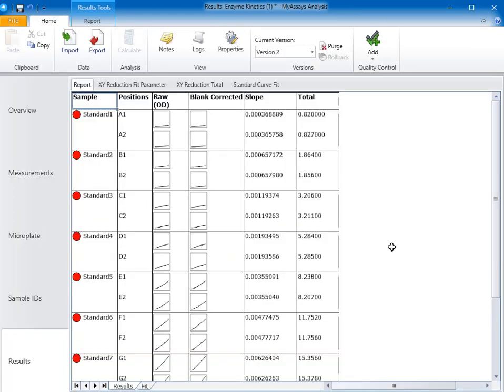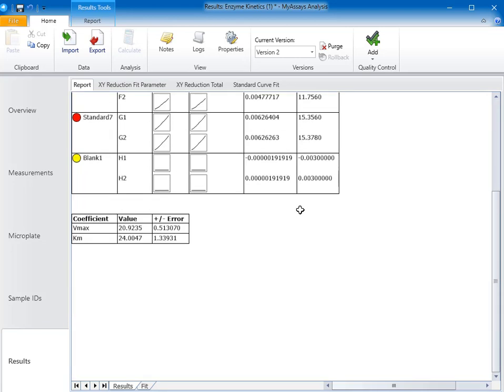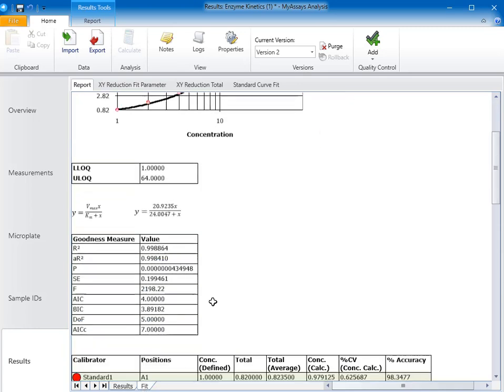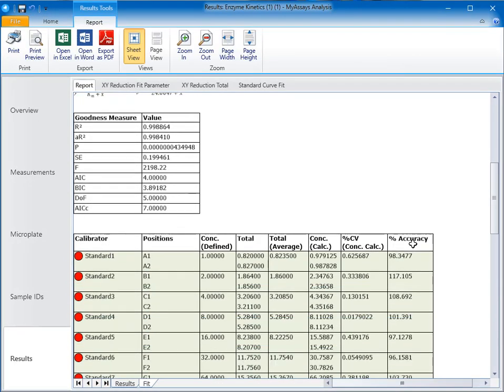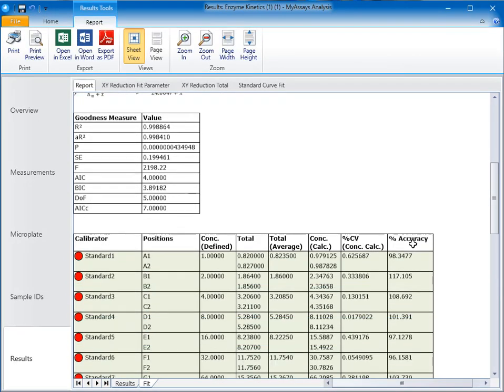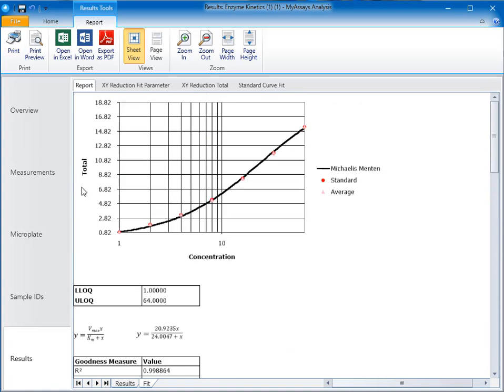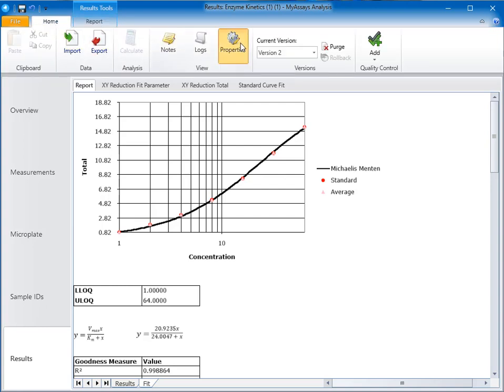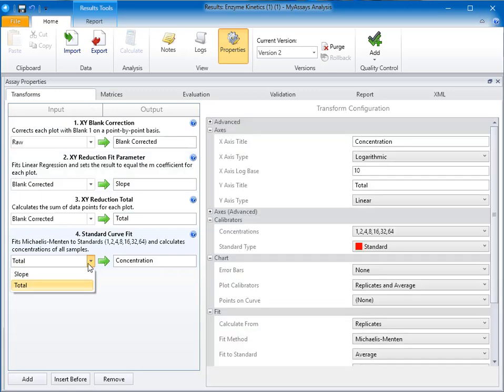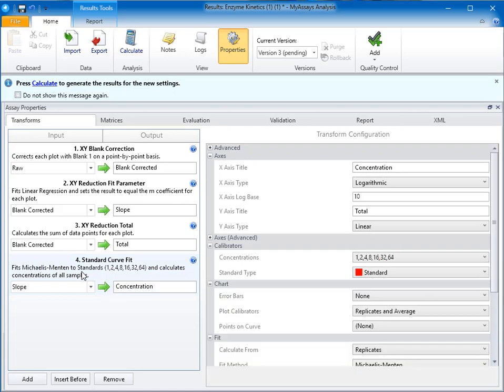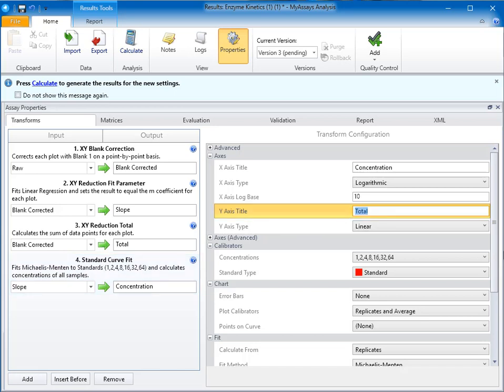Now on our report, you'll see two sheets, a results sheet and a fit sheet. On the results sheet, we can see our simplified sample table, as well as our Vmax and Km. The fit sheet contains the results of our standard curve fit and its details. You'll recall that my assay contains two different reduction transforms, the slope and total transforms. I've calculated these results using the total transform as the input for my standard curve fit, but I could easily have used the slope. To make that change, I can open the properties control, and on the transforms tab, for the standard curve fit, I can use this drop-down box to select the slope matrix as opposed to the total matrix for the input. Once I've made that change, I'll also change the name of the y-axis from total to slope. Let's recalculate. Now on our report, you can see that the results have been calculated using the slope instead of the total.